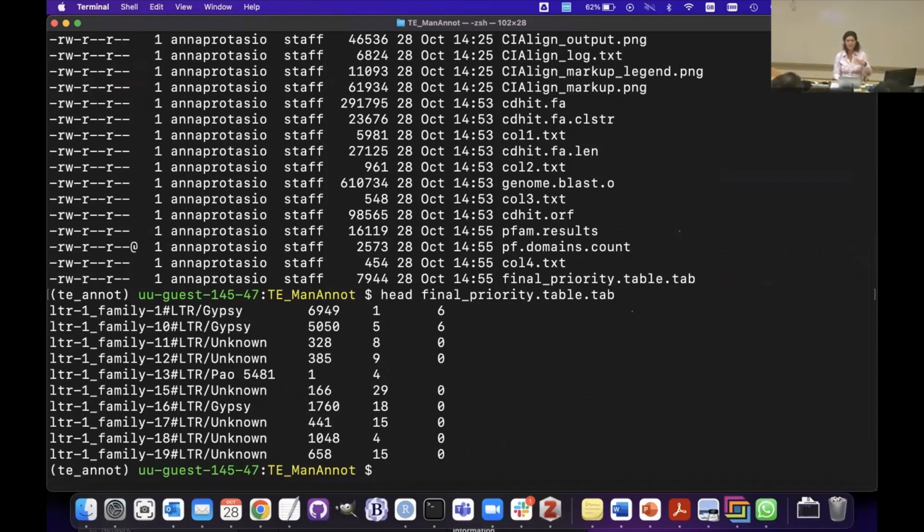I would recommend you start with the ones that have more protein domains and have more BLAST hits. And of course, 1, 5, and 10 are going to be small because it's a tiny little chromosome that I generated for this demo. If you have a full genome, some of them might only have 10, and I'm sorry about that. But some of them will have 500, and that would be a really good place to start alignment. Maybe choose 50, about 500.